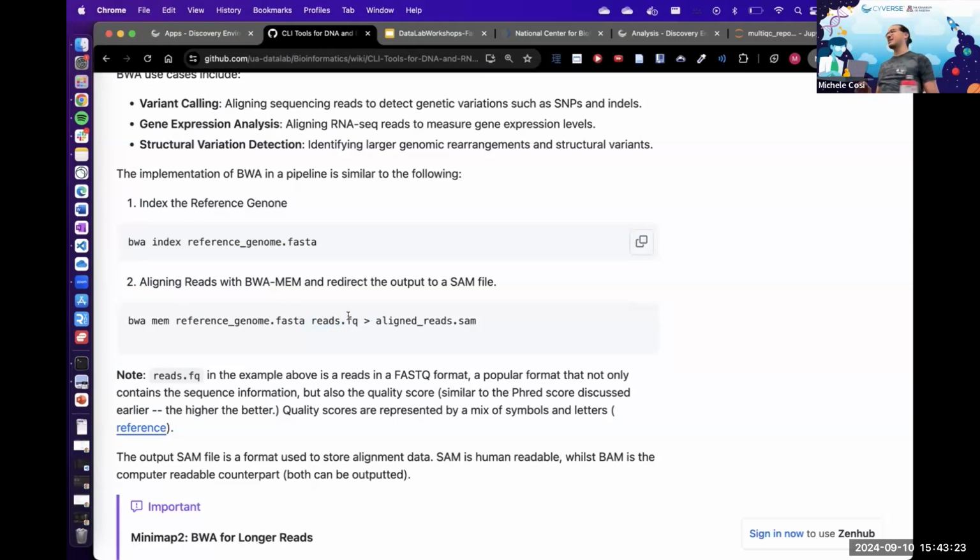So imagine it as you go to NCBI and you're working on human. You will download the human genome first. You will need to index the human genome, and then you can align all of your read data onto the genome itself. So just making sure that we're on the same page on that. Now, what's happening is you've got basically a file as a reference, your data, and your algorithm.